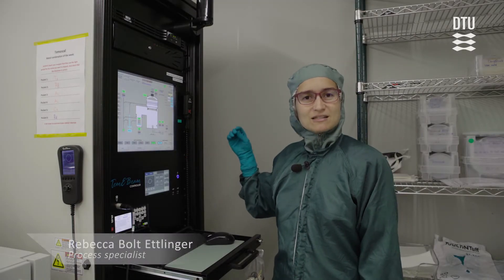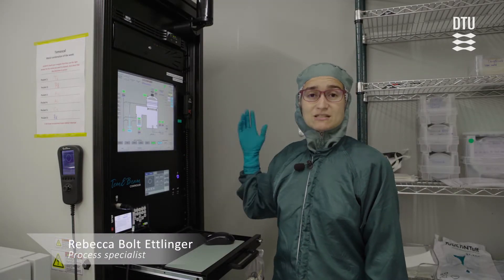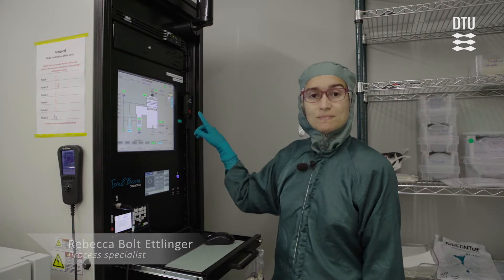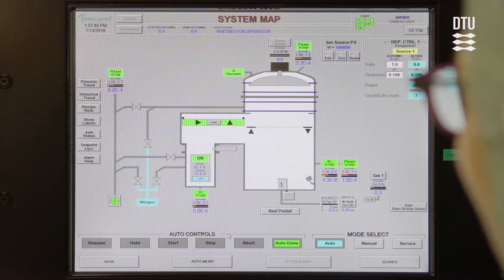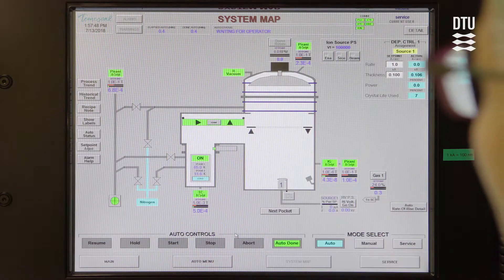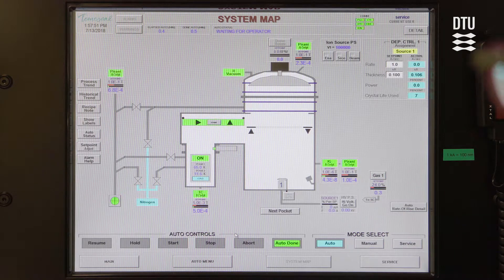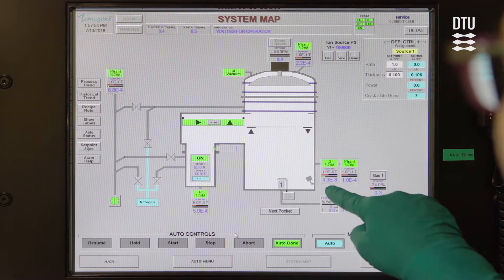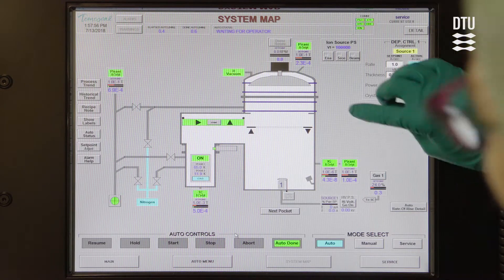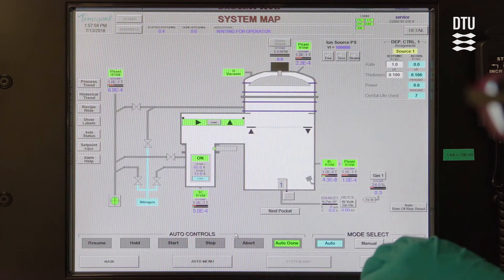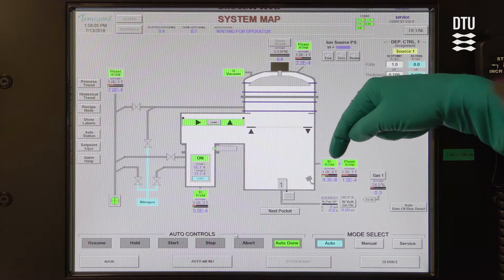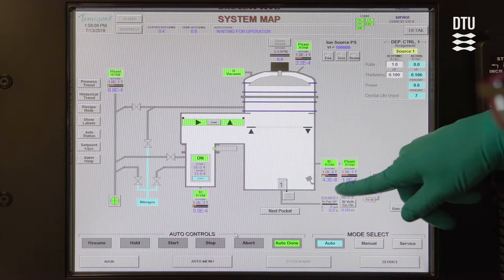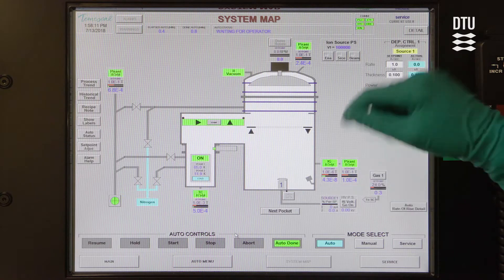The Temescal is controlled with the Temescal control system, which is software found on this computer. When you arrive at the machine, it will typically show the system map once you've logged on and it's unlocked. On this system map you can see what status the machine is in — right now it's pumped down and at quite a low pressure. There are different pressure gauges shown around here, but when it's at low pressure we look at the ion gauge pressure reading, which shows 4.3 times 10 to the minus 8 torr.